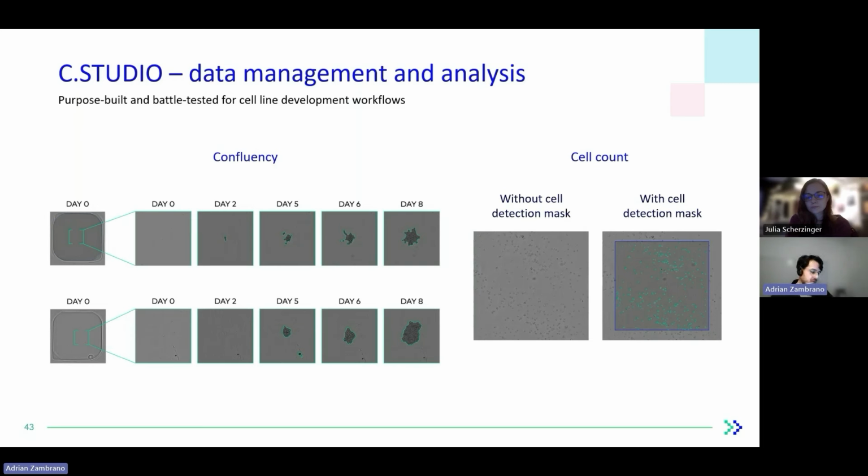Can I use conditioned media? Can I supplement? Can I look into different plate types? We have done the same for the HEK lines, right? So that's a similar process that works across the board. For plate optimization, it's important to, of course, take the technical aspects, but also financial considerations.